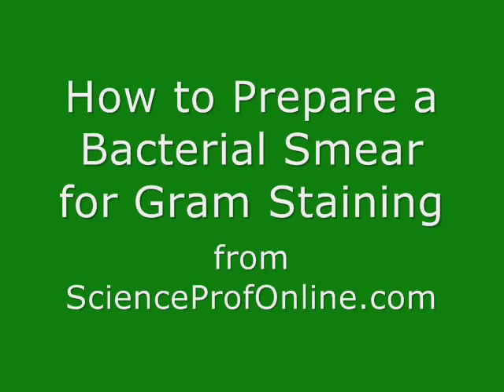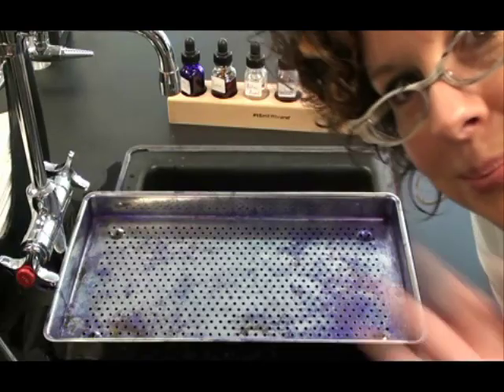In this video I'm going to show you how to prepare a bacterial smear for Gram staining. First things first, let's put on our goggles.